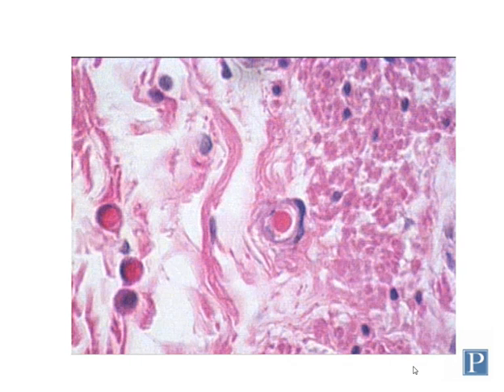Alright, hello. This week we are going to be taking a look at the circulatory system and the lymphoid system. So let's talk about the circulatory system first. We're going to look at blood vessels of different sizes. So let's start with capillaries.